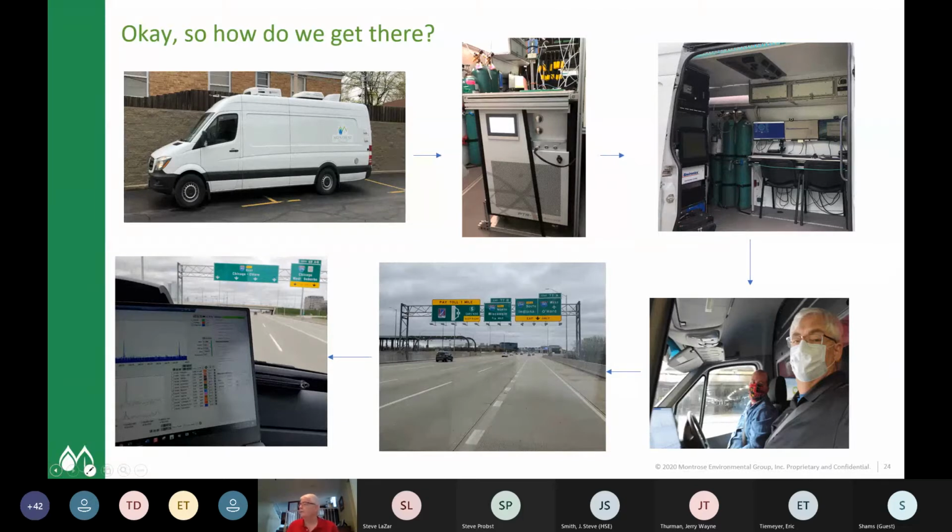So we followed all these steps. We pop on the major east-west interstate in Illinois to O'Hare, and this is about 10:15 on a Monday morning, and usually it's bumper to bumper traffic, and you're going 10 miles an hour. This is it. As you can see, there is really no one there. It was actually kind of almost eerie, but really very strange. In the 25 years I've lived here, I've never seen this before. And then we're actually driving down here, and I can actually control the instrument from inside the cab as well, so I don't get bounced around in the back.